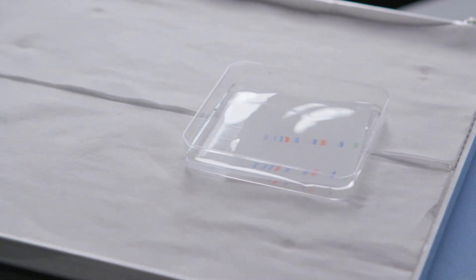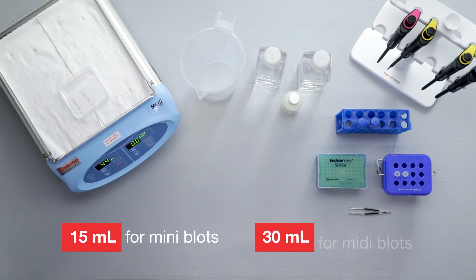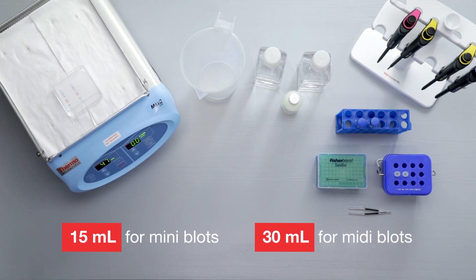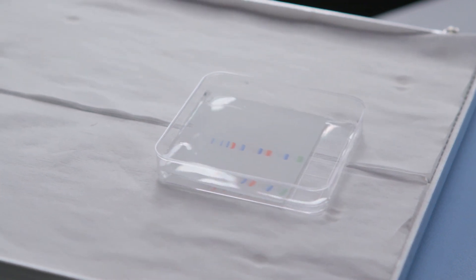For typical incubation trays, use at least 15 milliliters for mini-blots and 30 milliliters for midi-blots to fully cover the membrane. Avoid low volumes, as differences in agitation and coverage can produce high or uneven background.